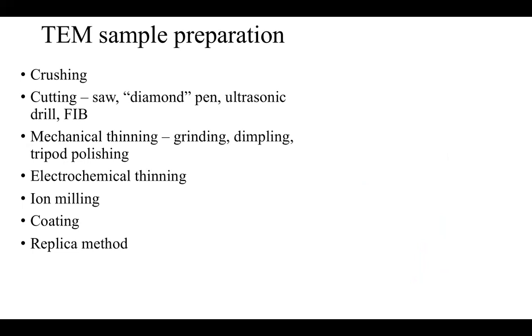If you're using colloidal particles, like nanoparticles suspended in a solution, you take a portion, you dilute it 10 times, 100 times, depending on your concentration. And then you just put a drop on the copper grid, because if the concentration is too much, that will make the meniscus, like you will have agglomeration around the meniscus, which will make it too thick for the samples to be observed properly. So you got to keep the concentration very low.